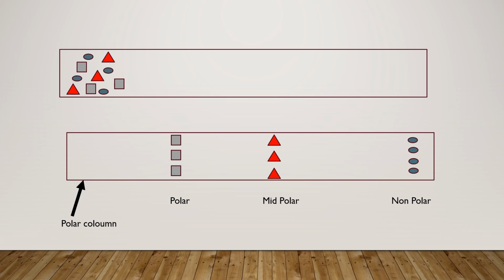So this is the principle of HPLC. This is the working of HPLC. This is how the mixture of sample is separated depending on its polarity. So depending on the analyte polarity and the column polarity, you can say there is separation of the mixture of the sample.